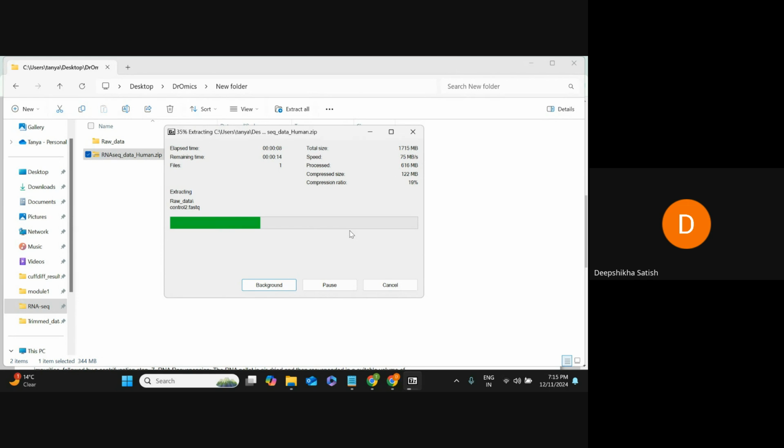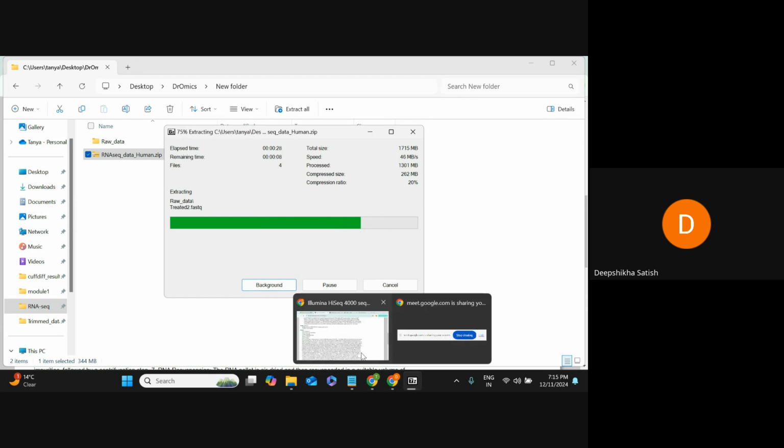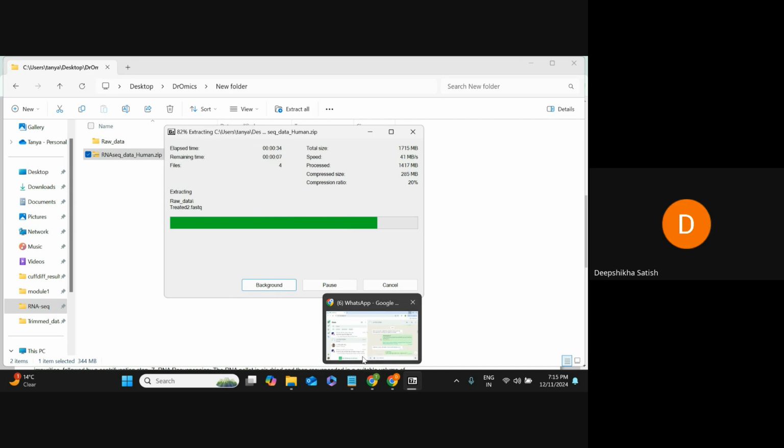Hamid sir, the drive link has been pasted there in the group. You can see your WhatsApp group. Yeah. Now I'm starting to download it. Okay, thank you. Everyone download this raw data and then you have to unzip it. You are going so fast so that we did not see. Anyway, I did not see how you extract. Okay, just wait, sir.